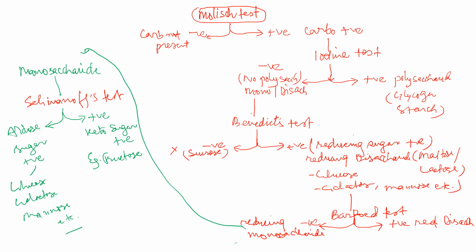Simply follow this flow chart and you'll be able to identify the monosaccharide, or the carbohydrate that is given in the solution.